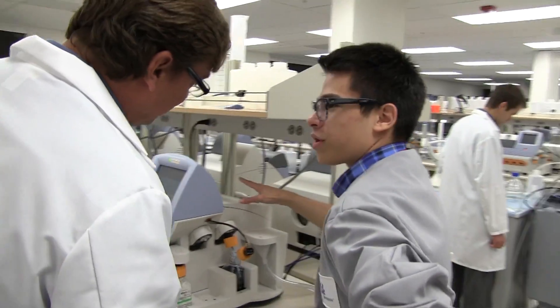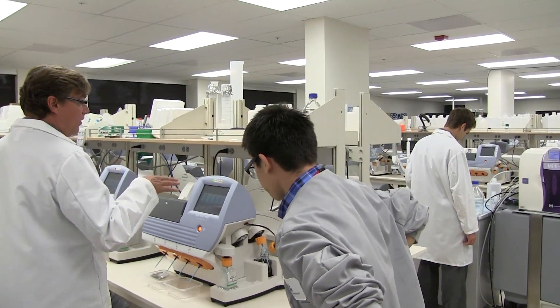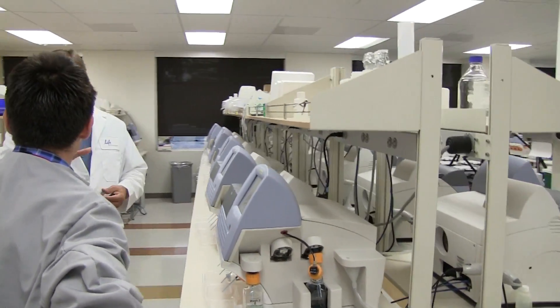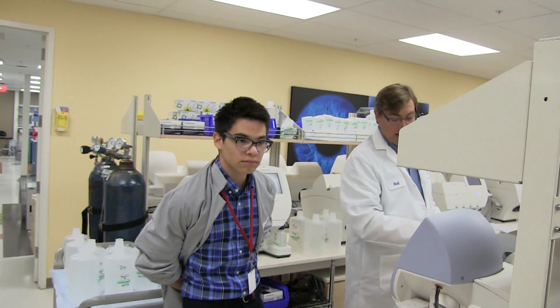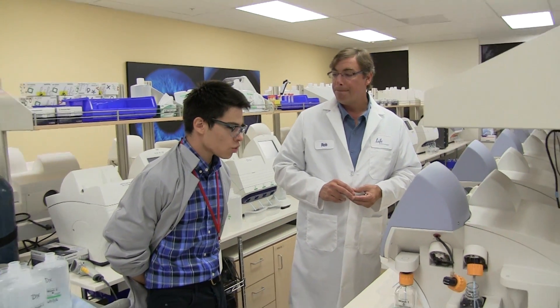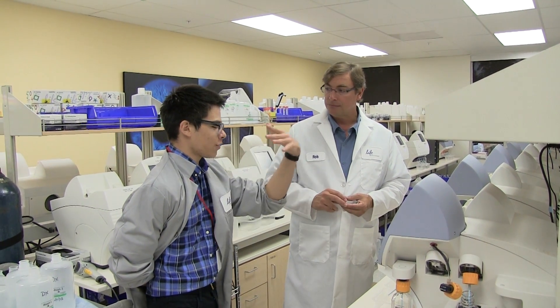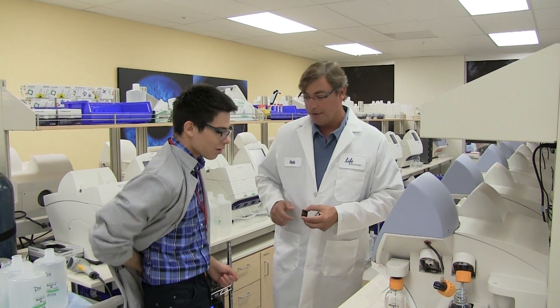This instrument does not have onboard computing. We have a very large server farm where data from all the instruments is processed. A typical customer would have one or two PGMs with a single dedicated server. The next step in Ion technology development is the Proton instrument.